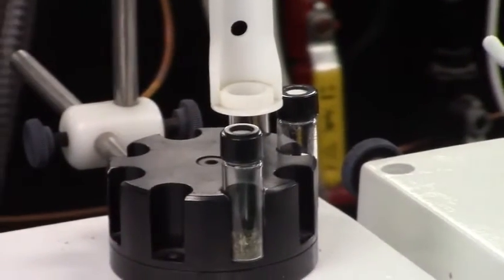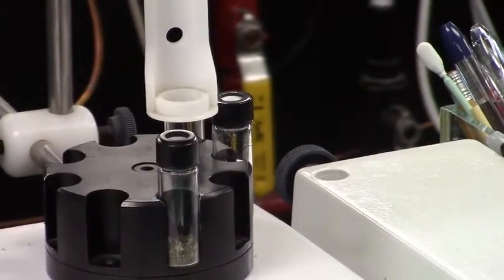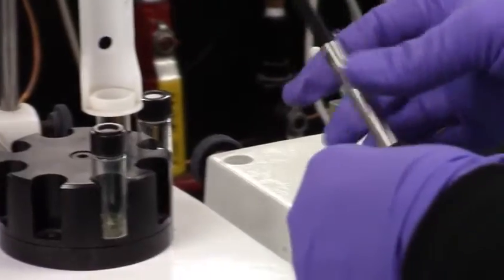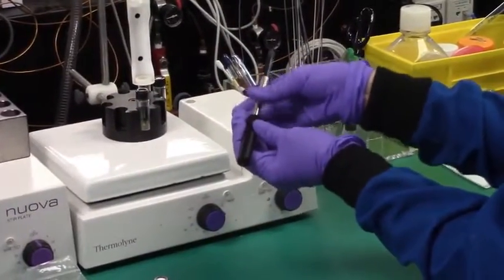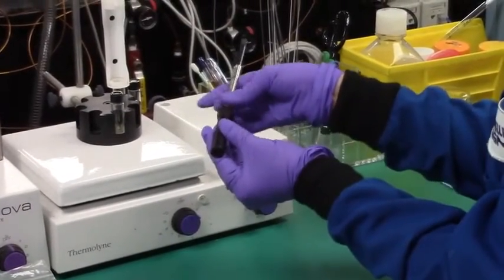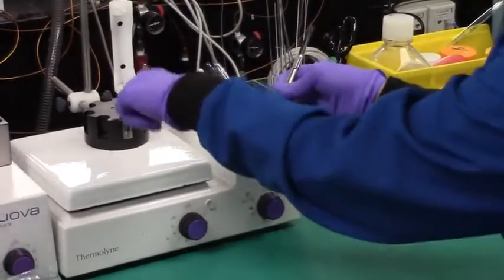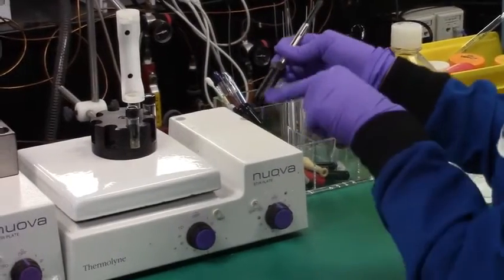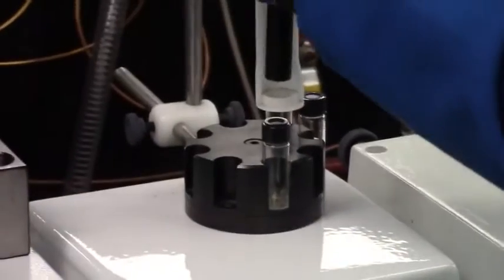So to do a manual extraction is pretty easy. I've got this nice setup which is commercially available that holds the SPME holder quite nicely. So the first step is you want to twist the top part of your holder and make what we call the needle part very, very small. The idea is that you don't want to be putting a long needle down through that septum because your chances of bending it would be fairly good. So now I've made it very short. So I'm going to open my holder and put it in.